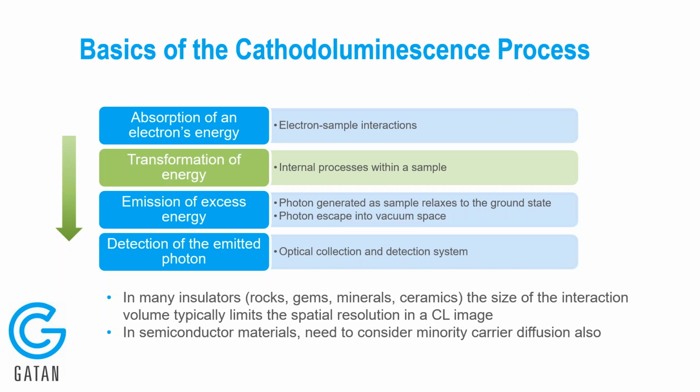other processes that take place within the sample between the energy from the electron beam being absorbed and a photon being emitted. In semiconductors, what this means is that we have to consider minority carrier diffusion.